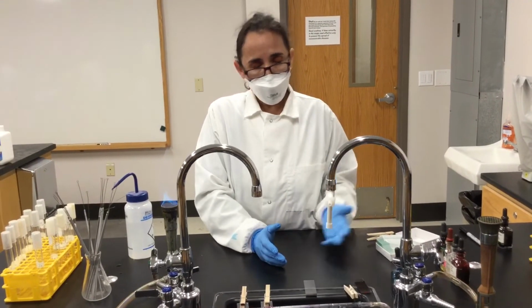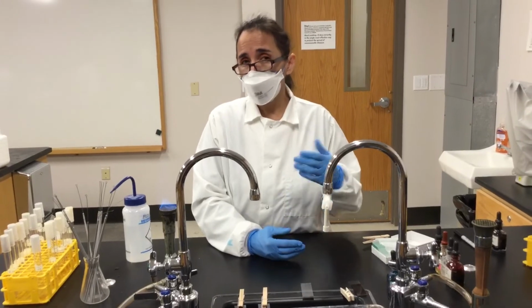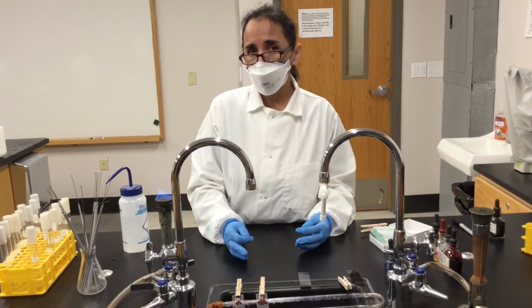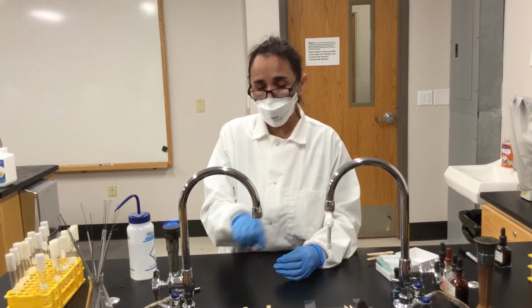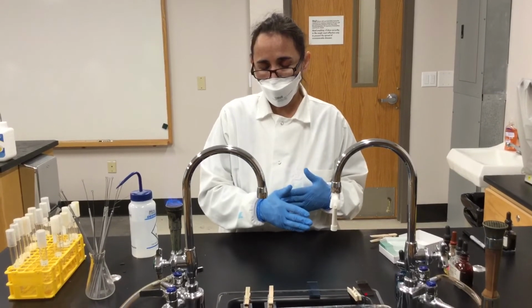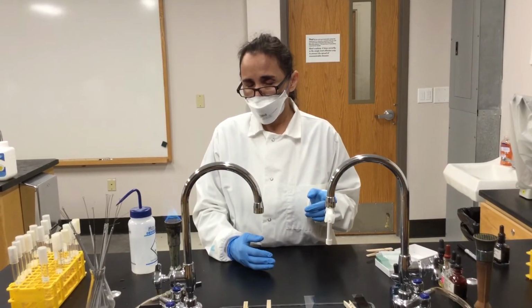And in the next step, when you are at the iodide, you create crystal violet iodide complexes that will get trapped in gram-positive bacteria when you add the decolorizing agent. But they will disappear, these crystal violet iodide complexes, from gram-negative bacteria, because gram-negative bacteria has less peptidoglycan in its cell wall. So when you add the decolorizing agent, which is alcohol, you create pores in this peptidoglycan layer, which is very small in the gram-negative, and through these pores, the crystal violet iodine complexes leave. So basically, after the alcohol step in gram staining, gram-positive will always look purple, but gram-negatives will look colorless.